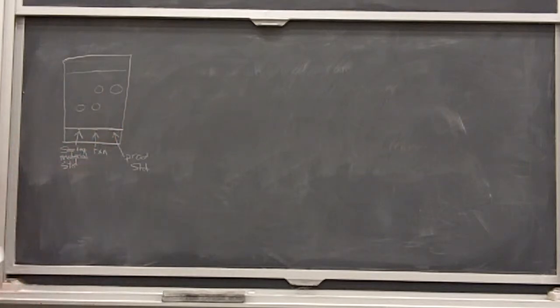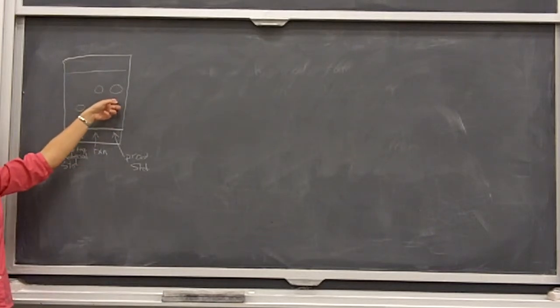We have a product standard there. So based on this TLC plate, if we go and make the measurements for our RF values, these two spots should have very similar RF values, and these two spots should have very similar RF values. So based on that system and knowing what's going on in the reaction, we can say, okay, our reaction mixture has some starting material left in it, and it's already made some product, okay?